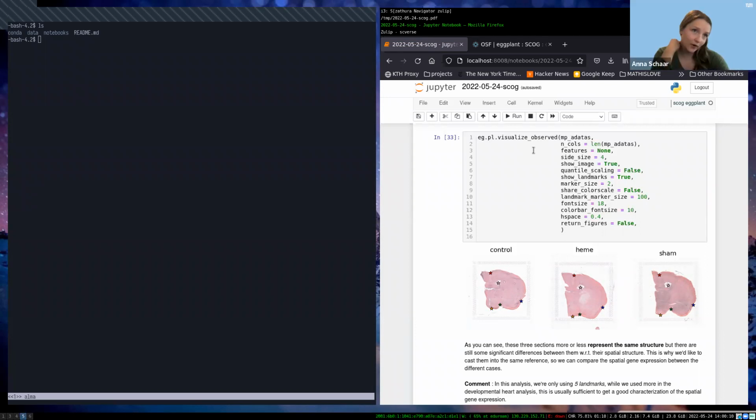I think there's also a similar question. The question was how you actually select the artificial landmarks. Would you just pinpoint a needle on the place where you would like to pinpoint the landmark, or how would that work in practice? Yeah, that's also a good question.